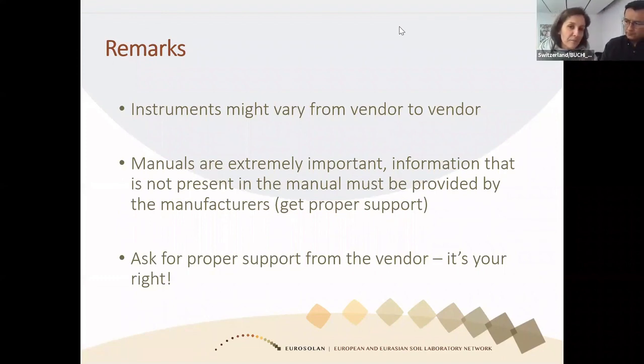There are libraries for pharmaceutical products, but we don't have them for fertilizers. And the other question, about mass and particle size for Dumas combustion: I think it's up to 1 gram that you can measure with this method in these capsules. And I think the particle size is 1 millimeter, I believe. But definitely it's just 1 gram maximum.